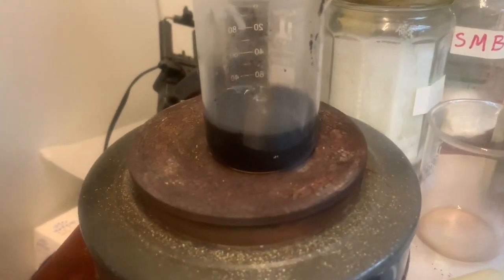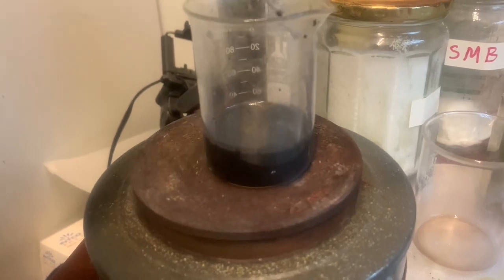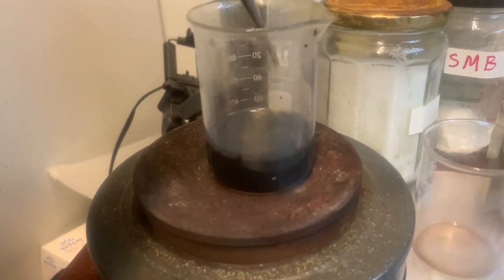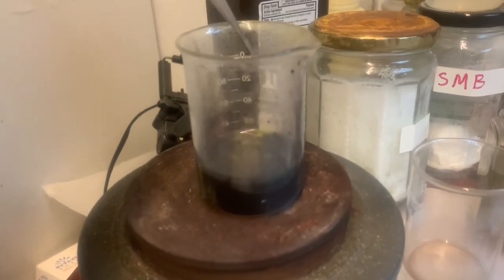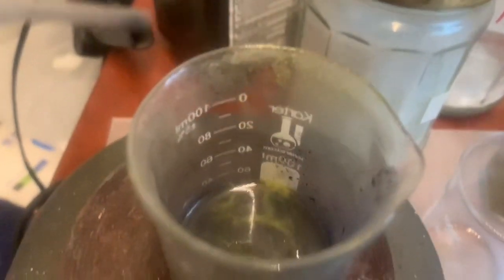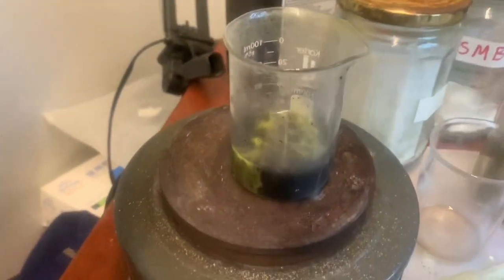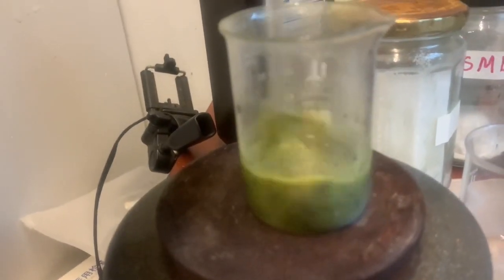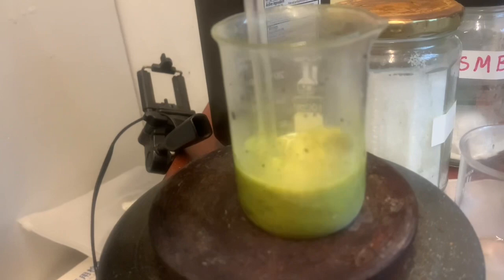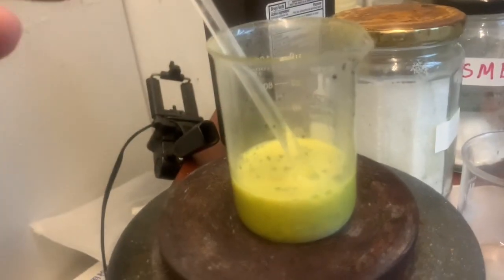Okay. So here on the surface I still see some stuff. Wash everything in one place, and I already see gold is dissolving. You see the yellow coming? See? Gold is dissolving. Okay. So right now we keep it till all this gold dissolves.